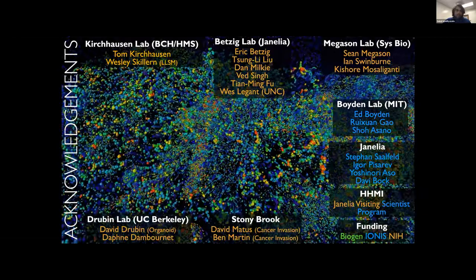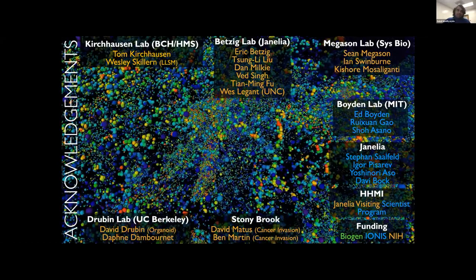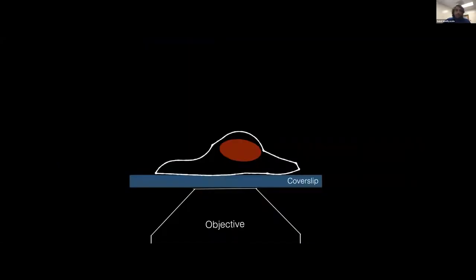Let's get started. So really the only introduction you need for the next few minutes is that you can take this beautiful cell on the coverslip. If you want to image the ventral dynamics that are attached on the surface, you don't need to use anything other than TIRF because that confines the excitation almost entirely within the depth of focus of this objective. It gives you amazing contrast and great signal to noise. Really, there's not a better tool for studying these ventral dynamics.